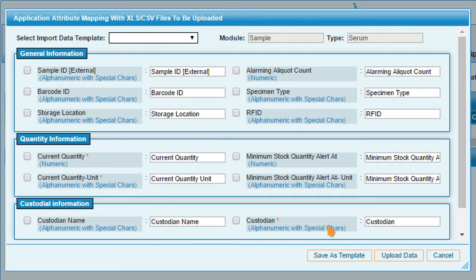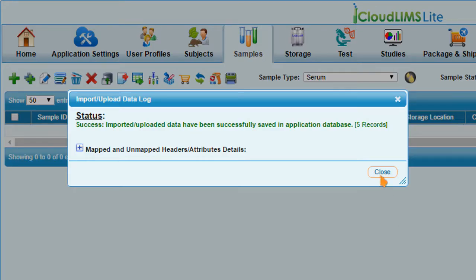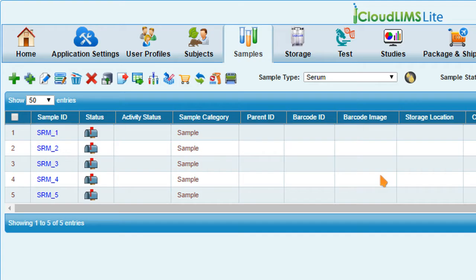You can use Save as a Template button to save the template for future use. Now click Upload Data for Parsing. All the new samples are registered with a unique system generated ID.